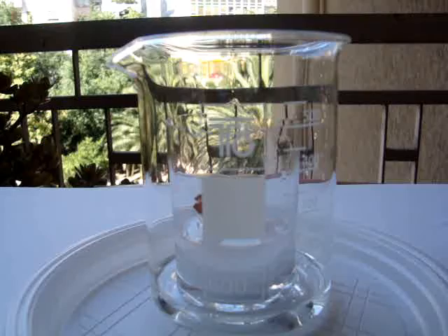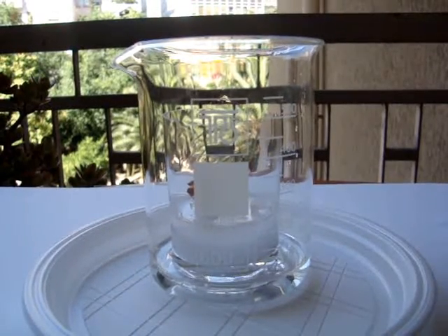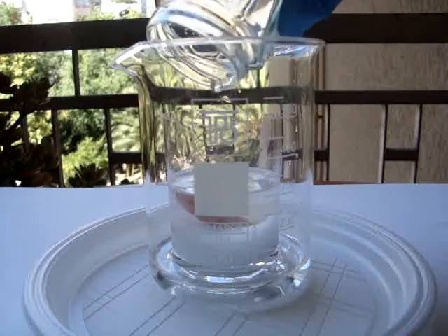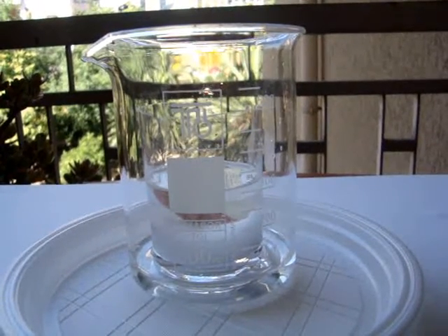After that, put the first container in the second one and carefully add 15 mL of 30% hydrochloric acid. Now place a container large enough to fit over the small container, but small enough to fit inside the other container.